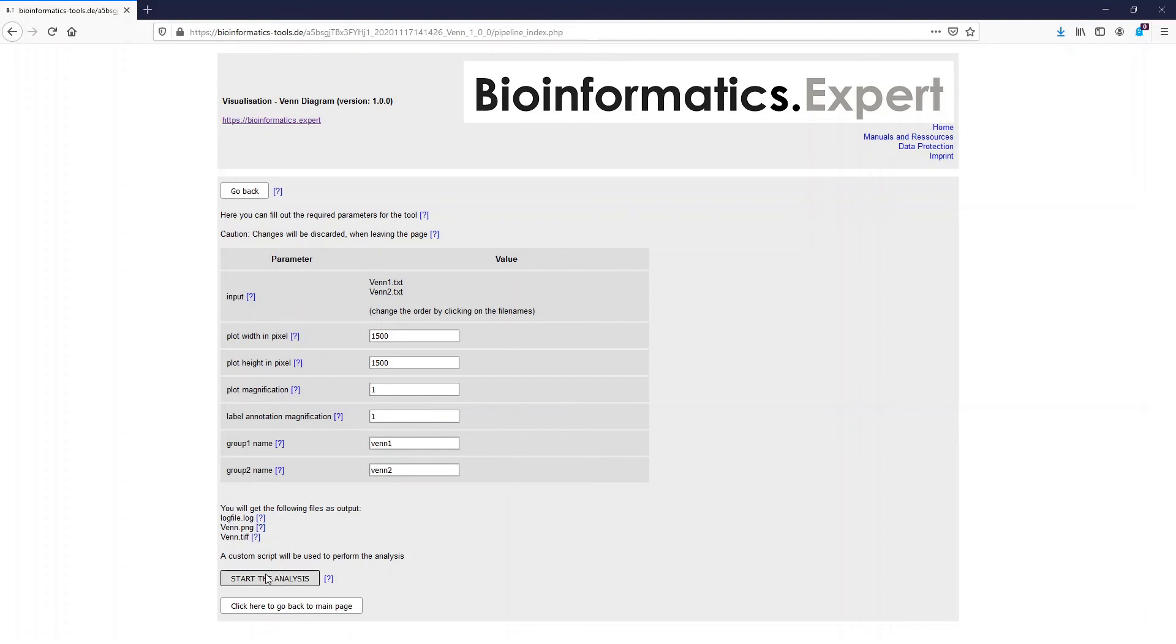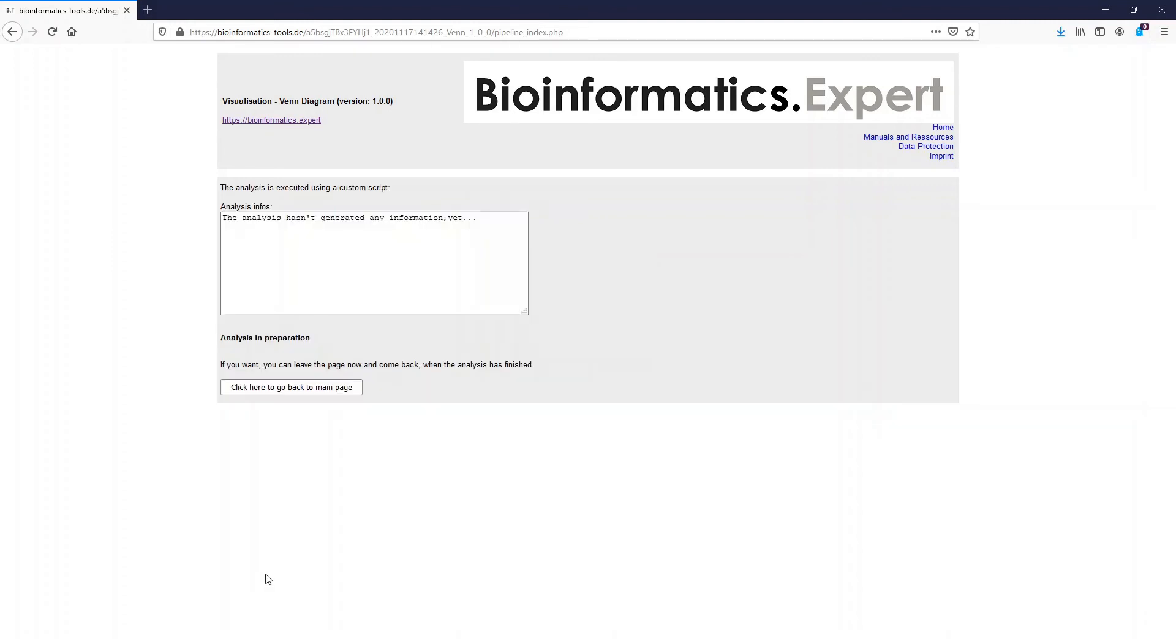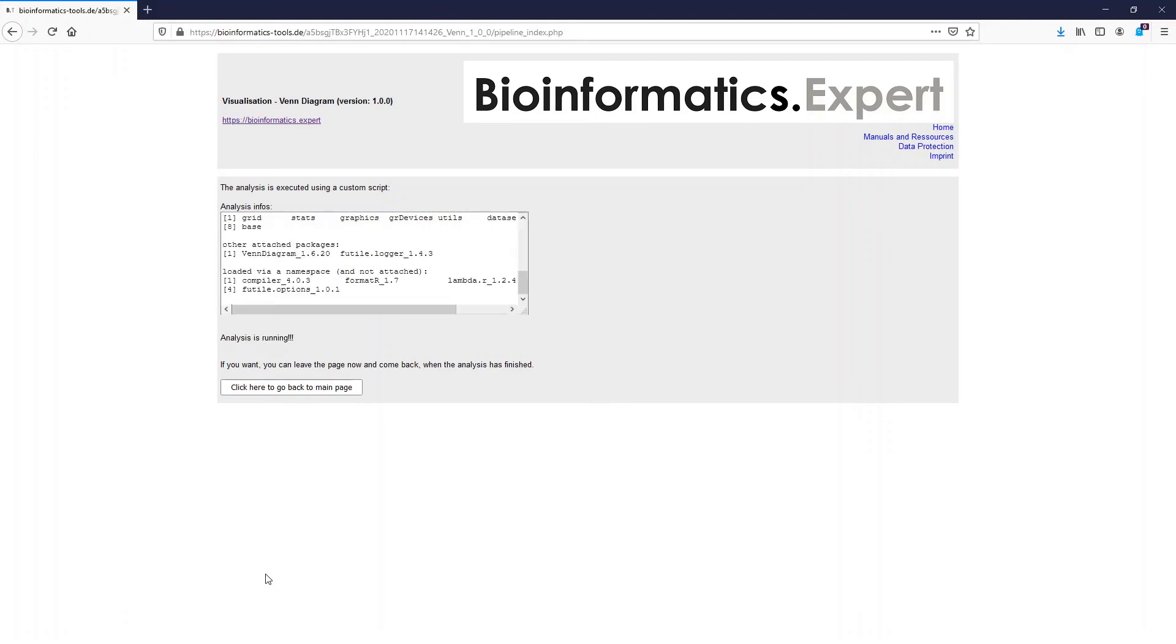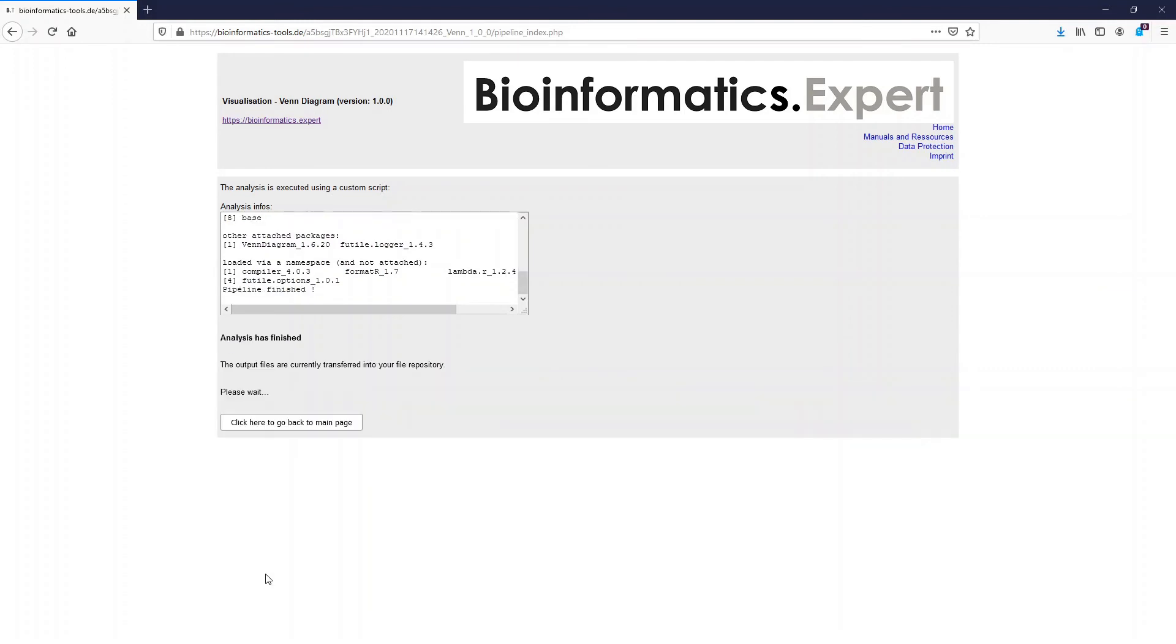Then I start the analysis by clicking this button and then we have to wait until the analysis is finished. A custom R script is started now which creates the output plots for us.